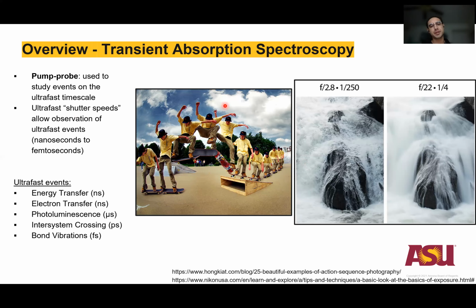I included this image because it represents how the data is collected in this sort of experiment, where we're taking snapshots at different times of an event and compiling them together so that we can see how the scene is changing over time.